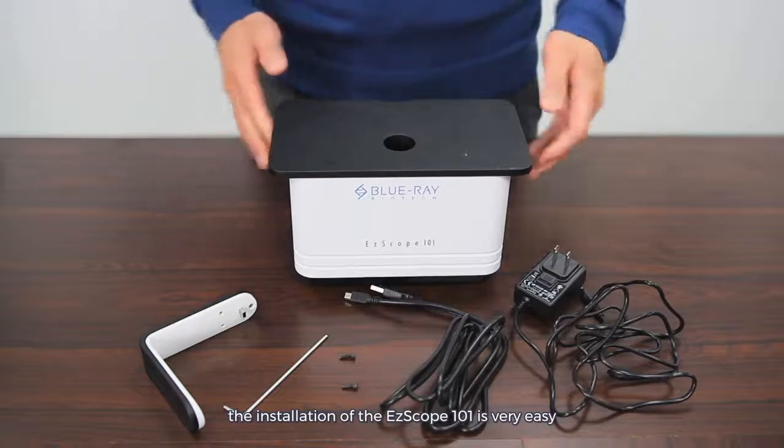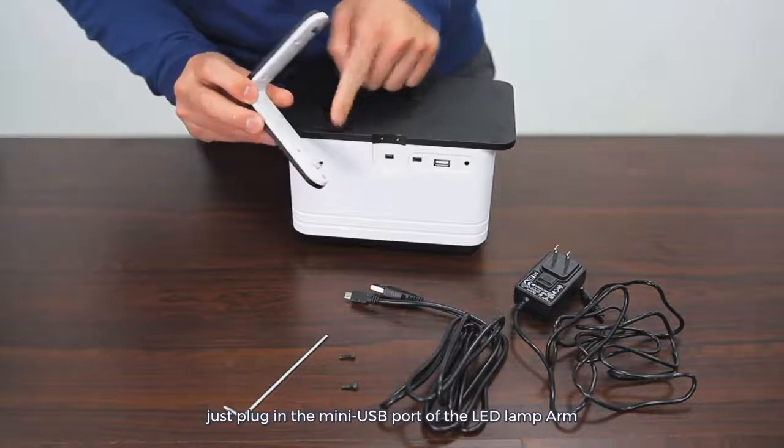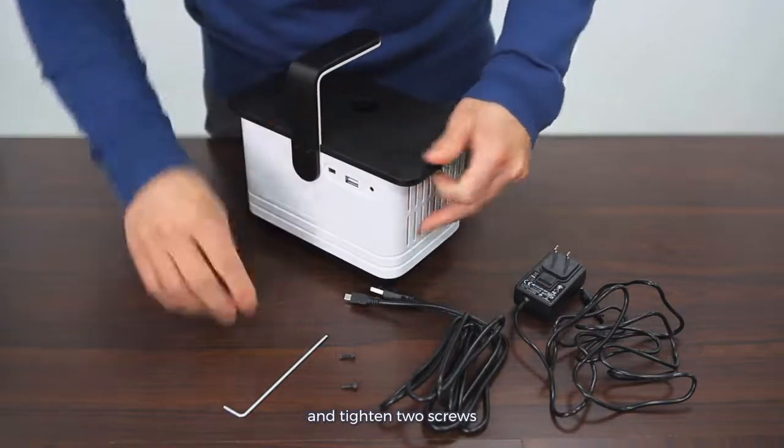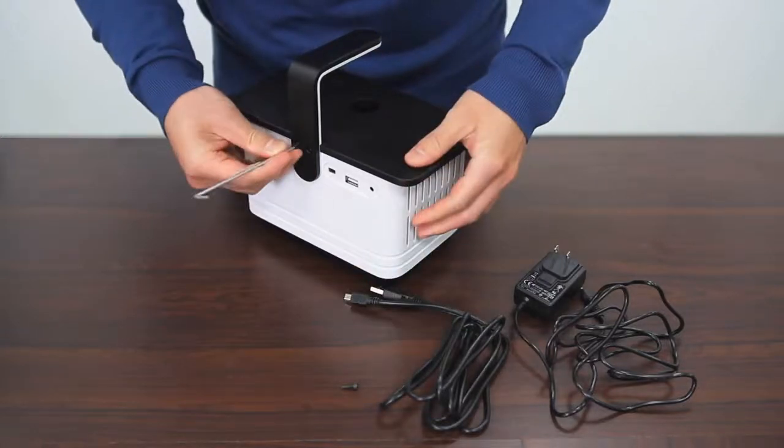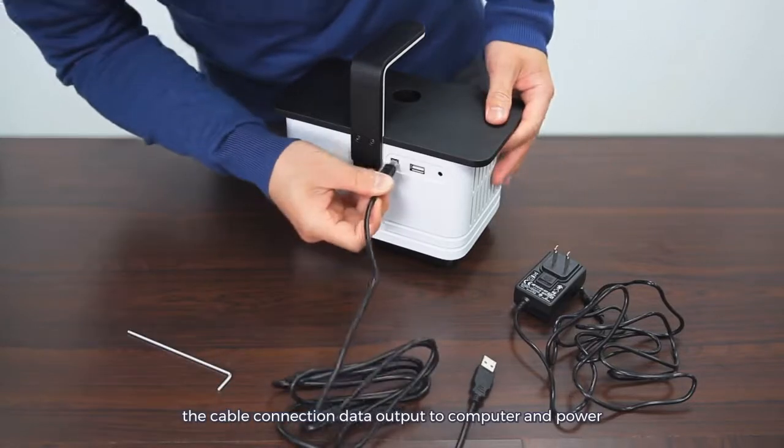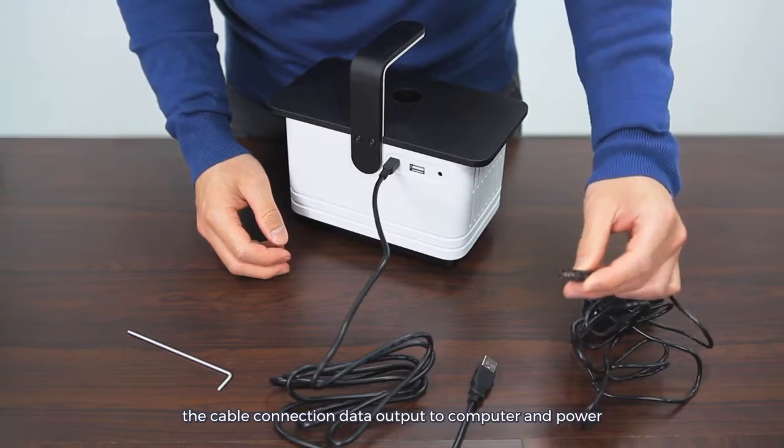The installation of the EZscope 101 is very easy. Just plug in the miniUSB port of the LED lamp arm and tighten two screws, the cable connection, data output to computer, and power.